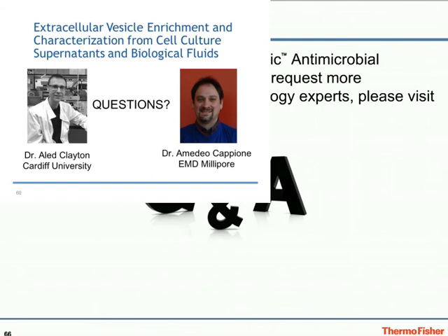First question is, I'm preparing vesicles from serum-free medium. Should I be concerned that the cells are becoming unhealthy and secreting apoptotic bodies that might confound the analysis? Dr. Clayton, maybe you want to start with that?